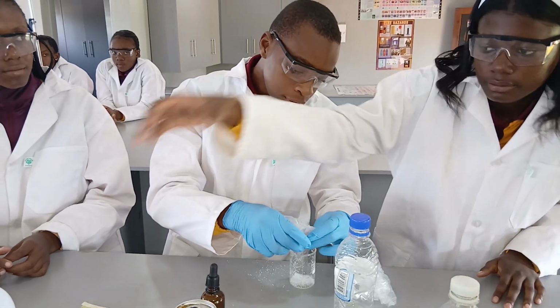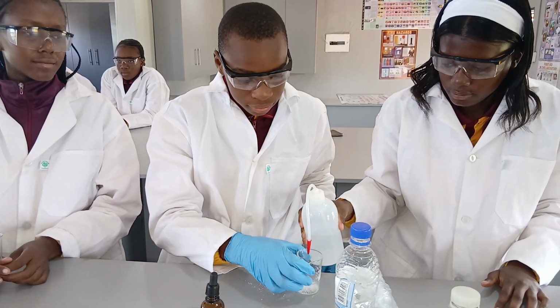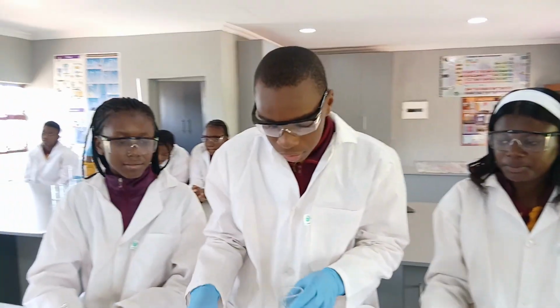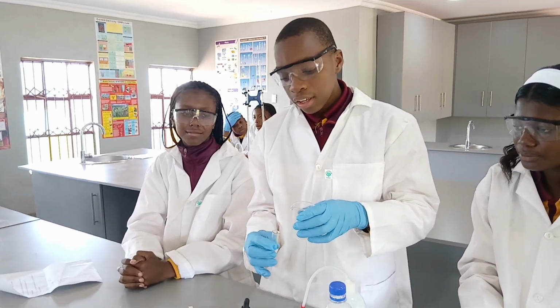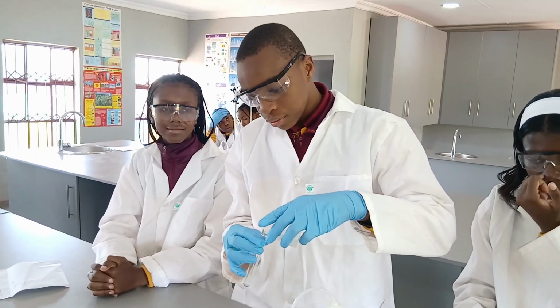Next, we check if salt water is an acid or base. So we'll pour our salt in here, then pour some water in it. We'll shake it so the salt dissolves into the water, and after we'll pour our sample into this test tube.